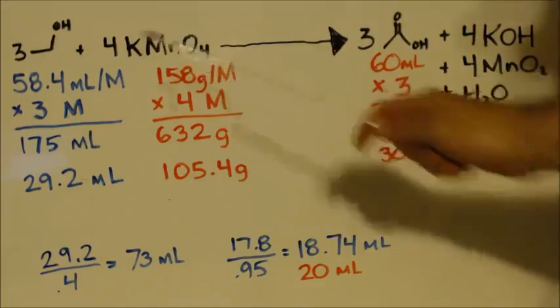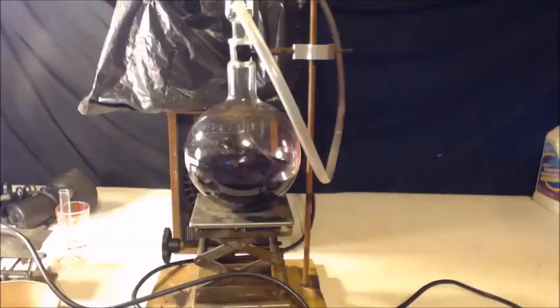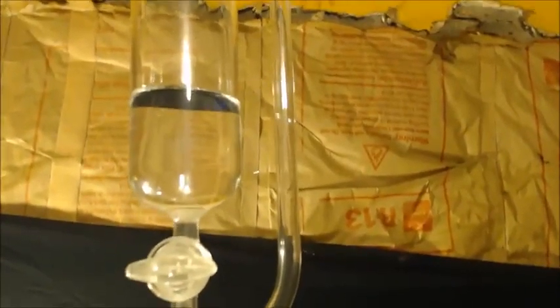Most books tell you that you should use acidified permanganate. I've got about 750 milliliters of water in here with 105.4 grams of potassium permanganate dissolved in it. Right above it I have a water-cooled coil condenser — the good kind. Above that I have 73 milliliters of ethanol — just vodka, 40%, so 60% is water — in an equalizing funnel, and at the top I have it loosely capped.